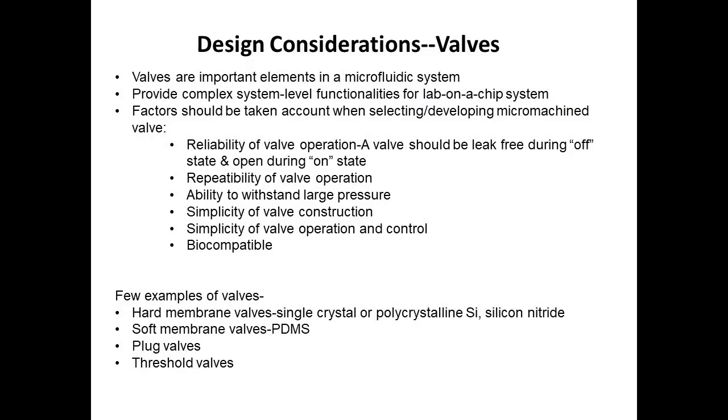This slide, number 39, is about the design considerations for the valves that you are going to use in microfluidic channels. Valves are important elements in a microfluidic system. They provide complex system-level functionalities for lab-on-chip systems. Factors to take into account when selecting or developing a micromachined valve: the reliability of the valve operation.